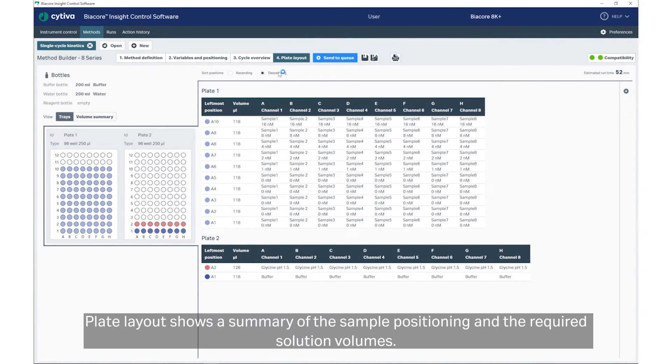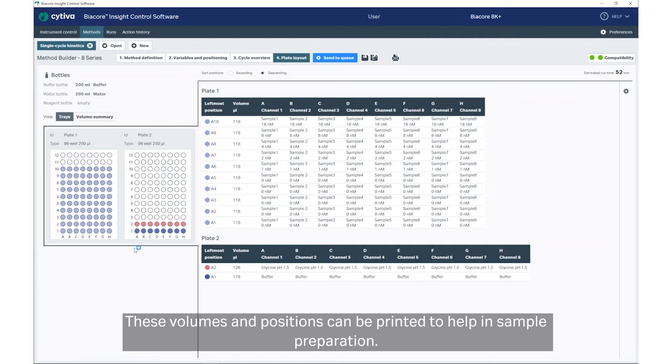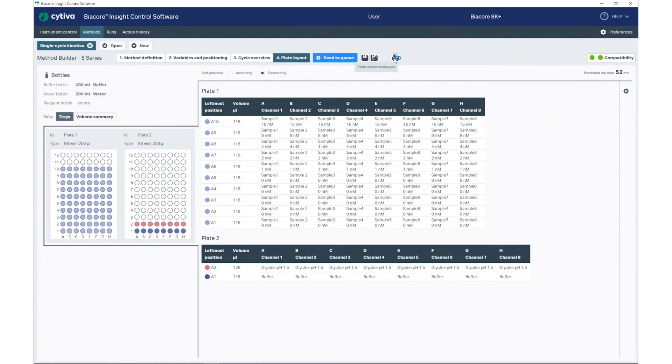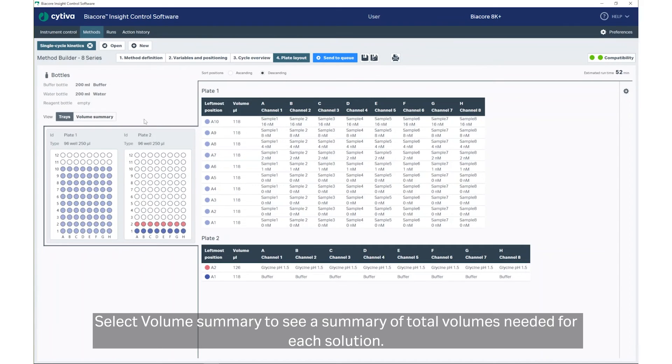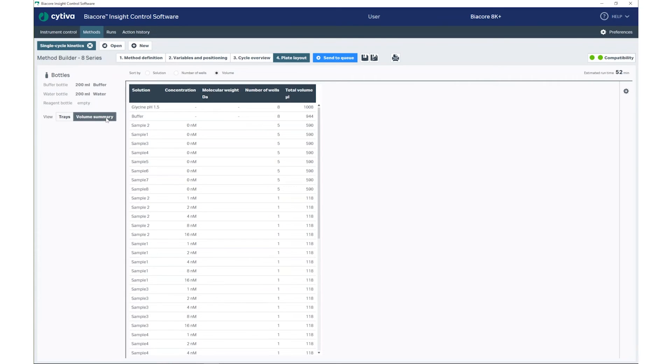Plate Layout shows a summary of the sample positioning and the required solution volumes. These volumes and positions can be printed to help in sample preparation. Select Volume Summary to see a summary of total volumes needed for each solution.